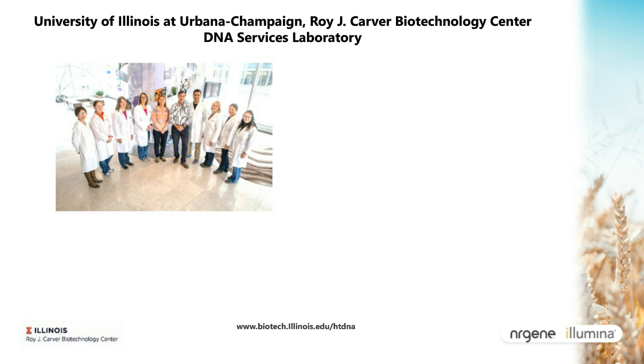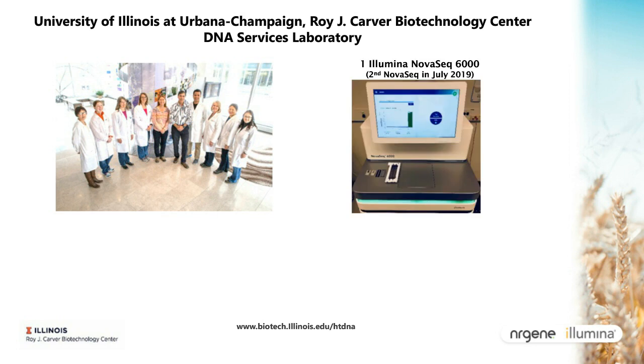Regarding the equipment that we have, right now we have one NovaSeq 6000. We also have several HiSeq 2500 and HiSeq 4000, but with the release of the new flow cells for the NovaSeq this year, all the HiSeq instruments became obsolete. The NovaSeq has a higher output and higher quality, so that really made the HiSeq 4000s completely obsolete.